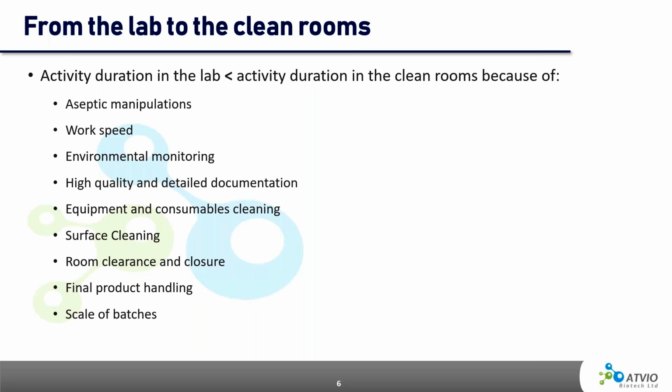In the clean rooms, each item should be both sprayed and wiped separately, and introduced into the hood only when all the vessels are closed. The operator is usually required to change sterile gloves, or at least spray his hands and wait for the ethanol to evaporate before continuing to work, which means the steps are longer in the clean room. And this is only a small example.